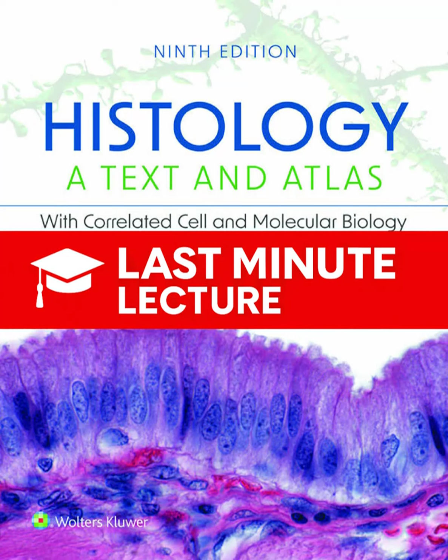Okay, let's shift from static molecules like DNA to dynamic processes. Enzyme histochemistry lets us see where specific enzyme activity is happening. Right, and the core principle here is really important to get straight. You're not actually seeing the enzyme molecule itself. You're seeing the reaction product that the enzyme creates.